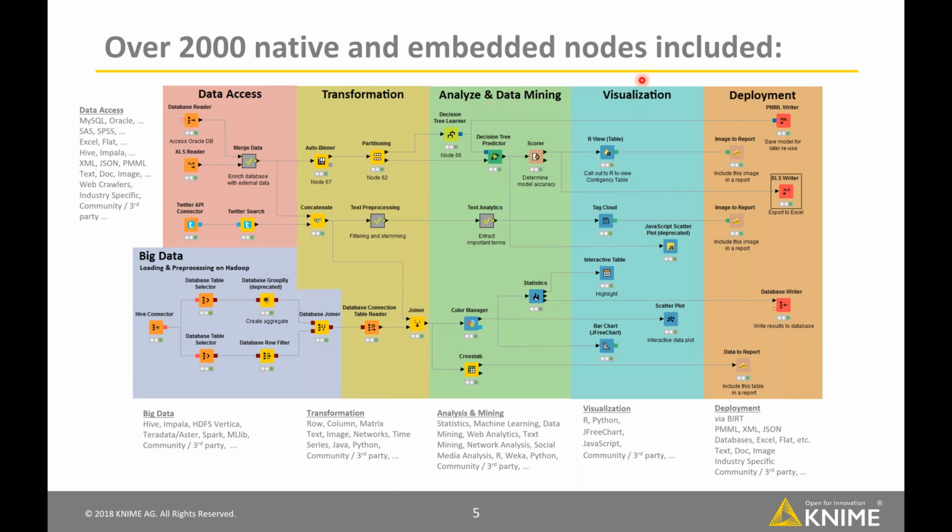Once you've done the analysis and data mining, you can then do visualization. We have a large collection of nodes for that. We also have connections for here, as well as on the transformation analysis part. We have connections to other open source tools.